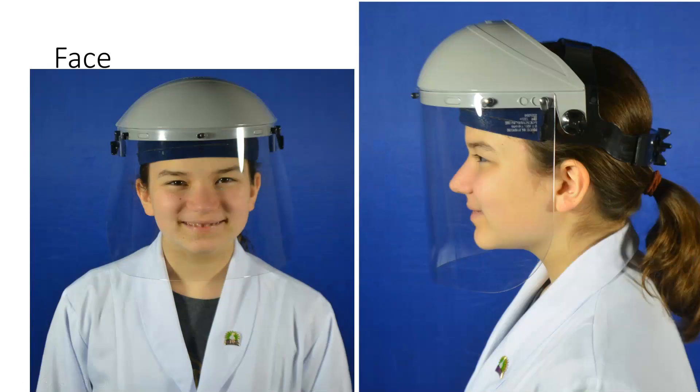If we look at face protection, this is nothing more than a face shield. A face shield like this keeps material from splattering onto your face, which is very important when you start looking at some of the more serious sorts of things, because anything that might splatter up is going to be stopped on the face shield. Whereas the glasses and the goggles protect your eyes, they don't protect the rest of your face.